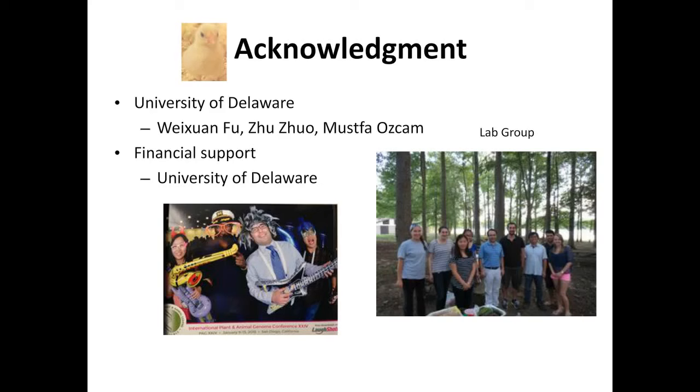That's why we wanted to remove those sites, to not have false positives. If the question is talking about the issues caused by poly-A stretches, the only way that we can solve it is in a bioinformatics way.